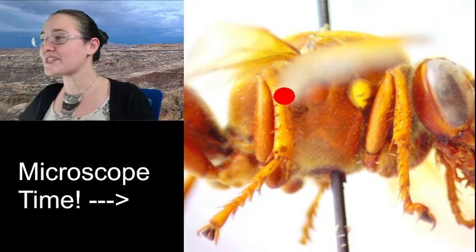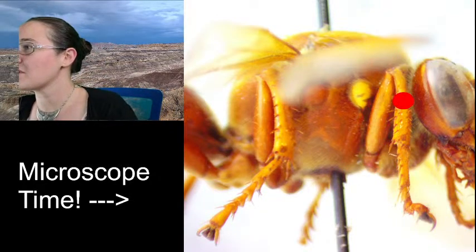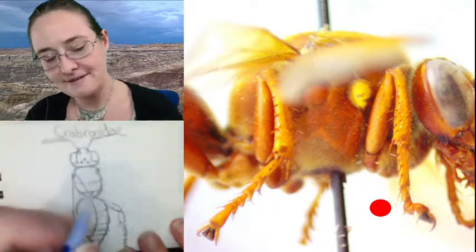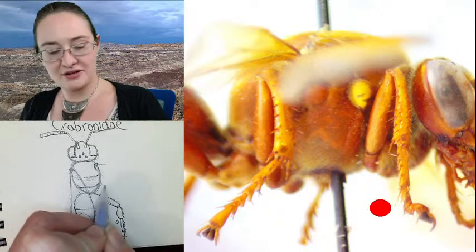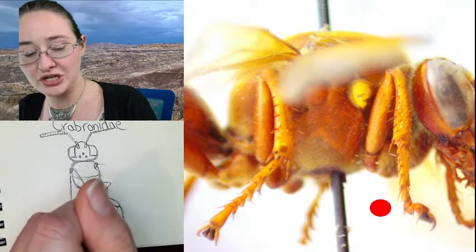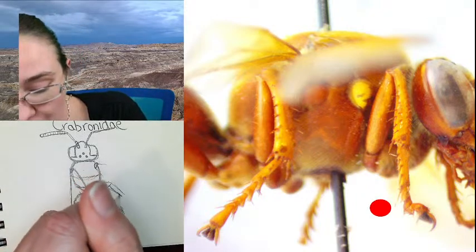Alright, so this is going to give us a better view of the legs. You can see right about here, right at that base, that's the coxa. Femur, tibia, and then all of the little tarsal segments. And we can do that on all of the legs. So the middle leg comes out right about in this general area. And generally, the middle and the hind legs go in the backwards direction, and the front leg goes forward.